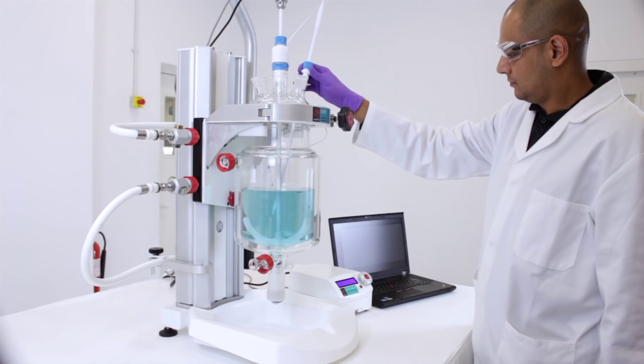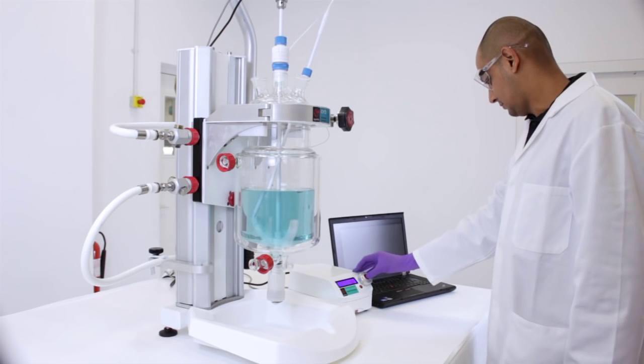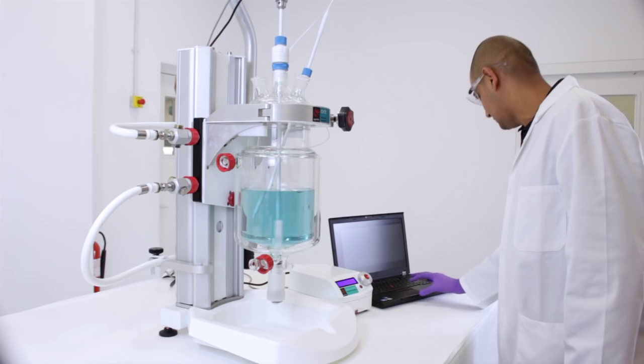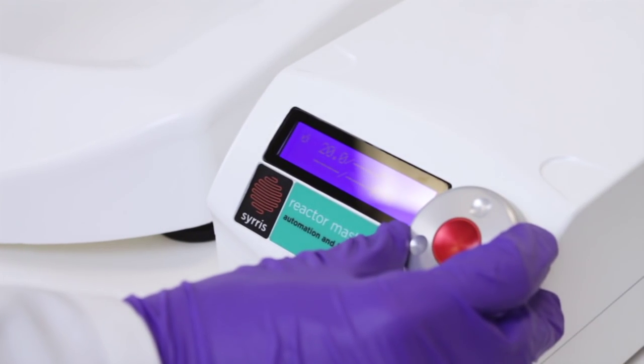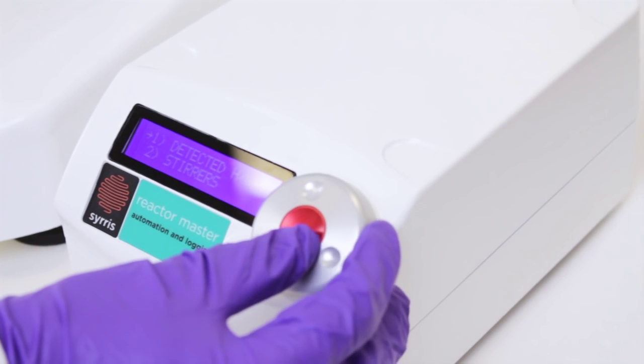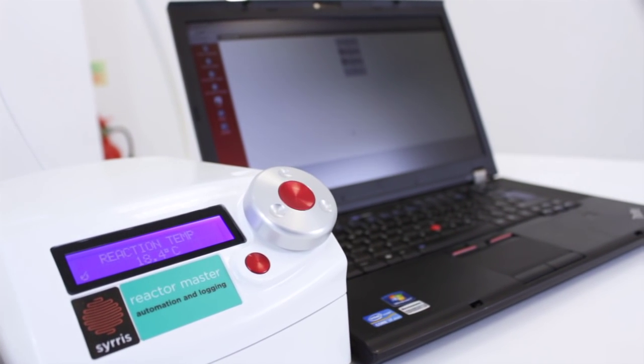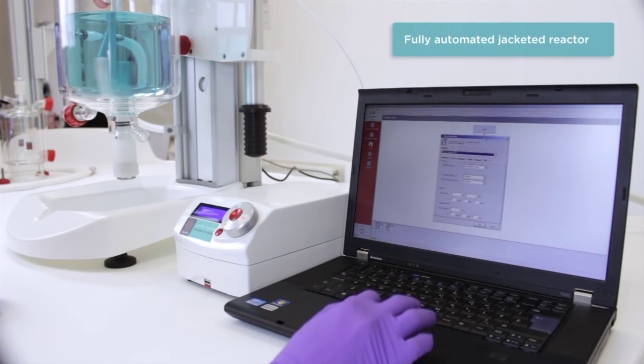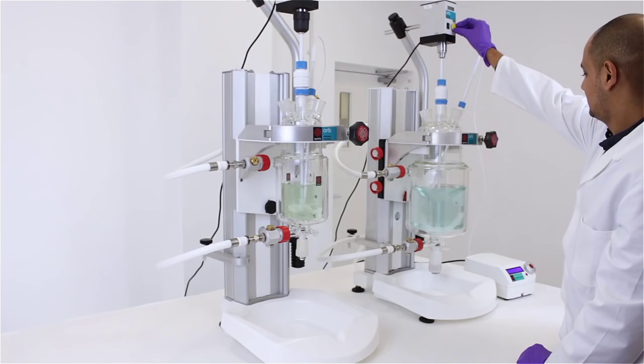For more sophisticated needs, Orb can be upgraded to allow automation. Add the Orb Reactor Master to automate, display and log temperature, stirrer speed, additions, pH and more, without a PC. Or add the PC software to convert Orb to a fully controlled laboratory reactor.